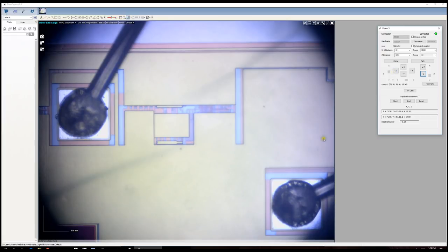Looking at the die, this green area is metal, and you can see underneath the metal is where all the circuitry is hidden — little interconnects between transistors and between different amplifiers. These are very small features, all under a top-level metal layer. There are holes in it probably because of density regulations for the ASIC manufacturing. Everything is blocked by metal because it protects against light coming down through the transparent package, and also for good routing of power and ground signals — a very typical technique.